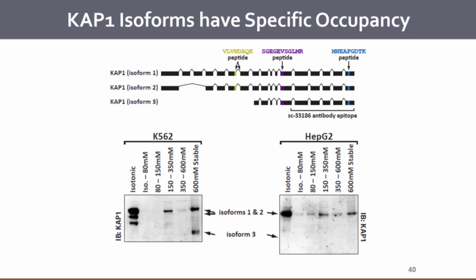Biologists often ask us, give us a list for the protein, but whenever a biologist studies a protein deeply, they know that there are 3 different proteoforms, and 4 alternative splice forms. We know that this one alternative splice form is only present in cancer and not present in another case. And the biochemists and cell biologists who study proteins really deeply know that these things are an issue, and they'll often come to you and say, your data doesn't make any sense because we know that there's this proteoform there and your data is not reflecting that.